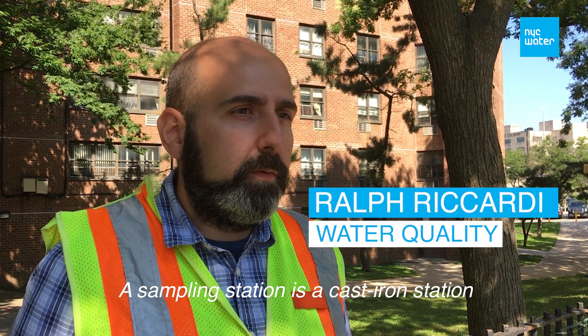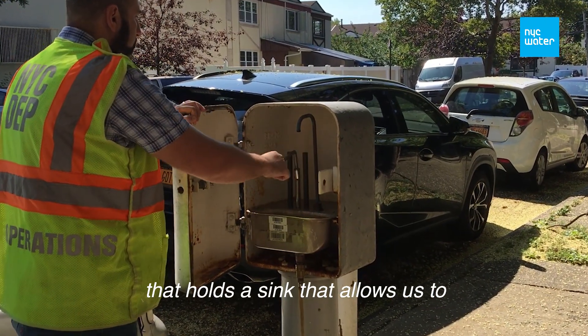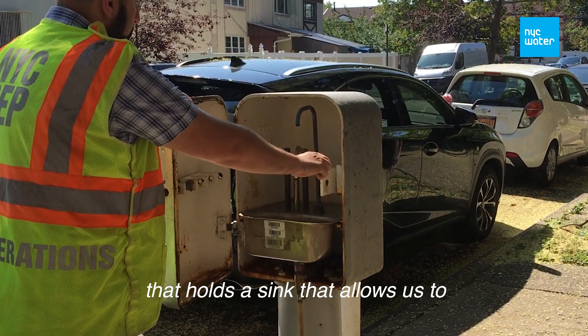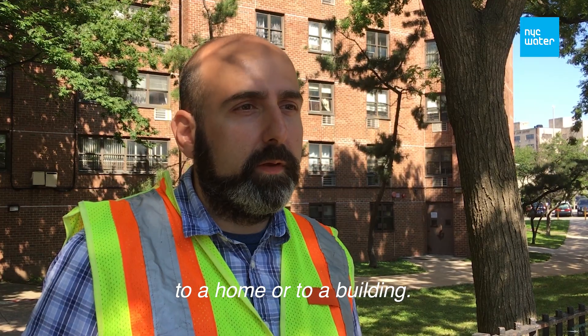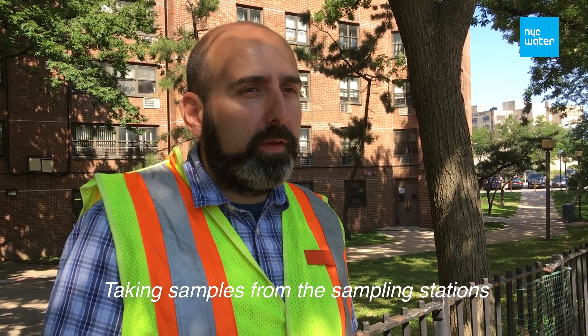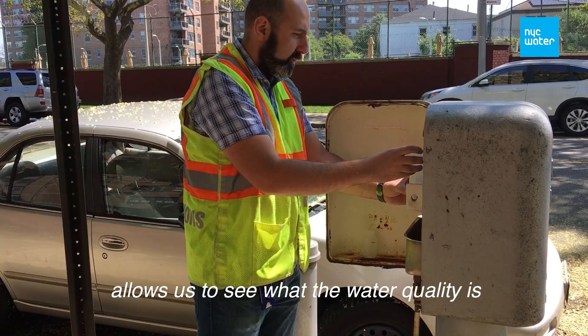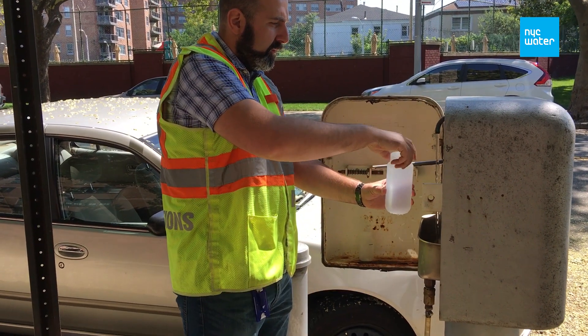A sampling station is literally a cast-iron station that holds a sink that allows us to test the drinking water that's being supplied to a home or to a building. Taking samples from these sampling stations allows us to see what the water quality is at any given moment when you take a sample.